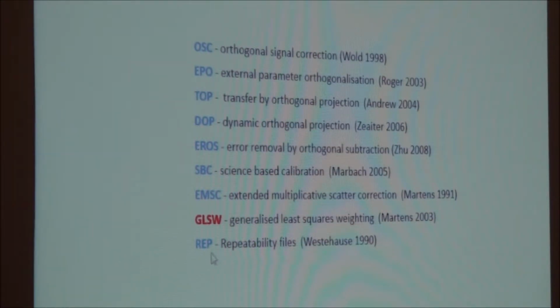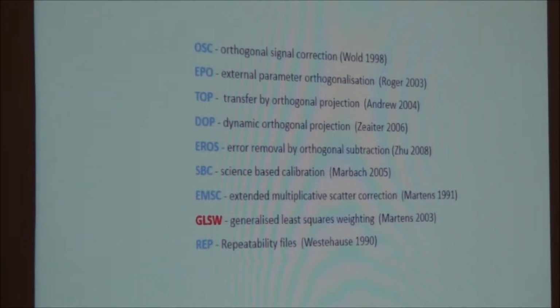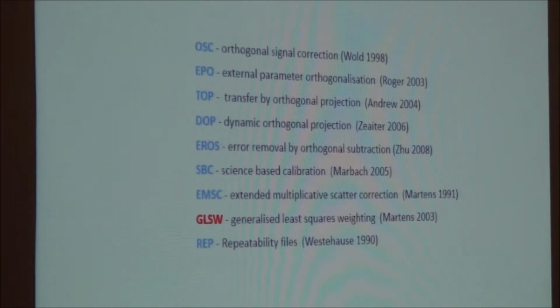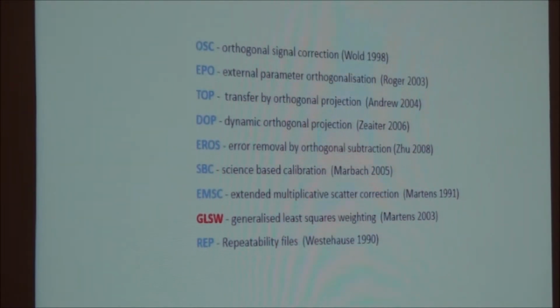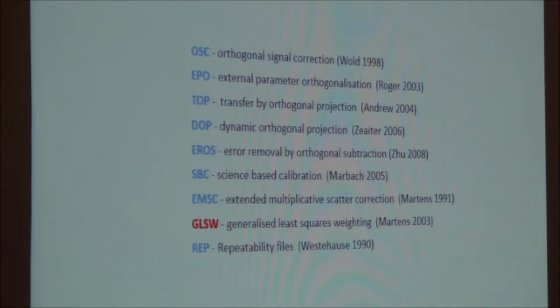The second prize winner in the competition used this method, REP, which is in the FOSS software. This is one of the methods that you can use routinely. I think many of the NIR instruments are FOSS based, so it's worth looking at. It's already inbuilt in their software.